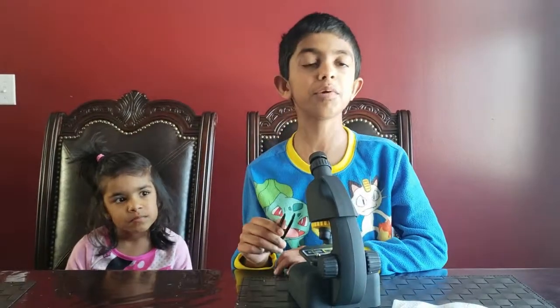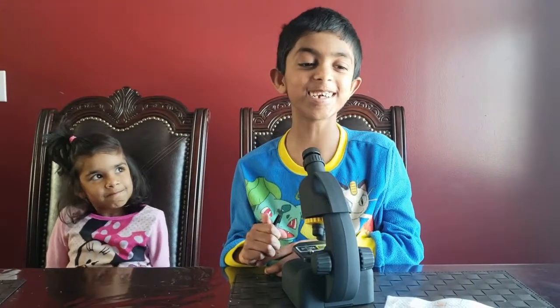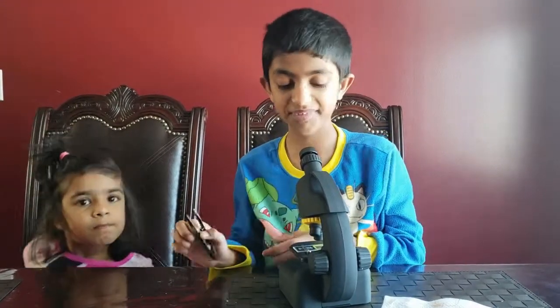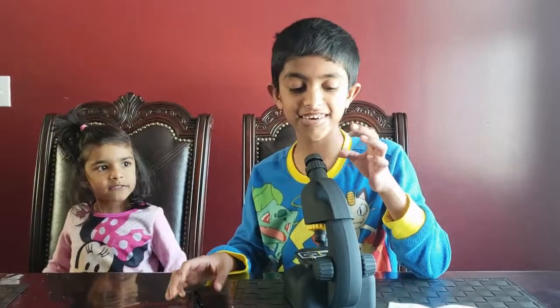So, if you're not familiar with a microscope — like, pretend you live in Antarctica — these are the parts of a microscope. First, we have the turner. If you look into it and you want to adjust the light, you can use the turner.